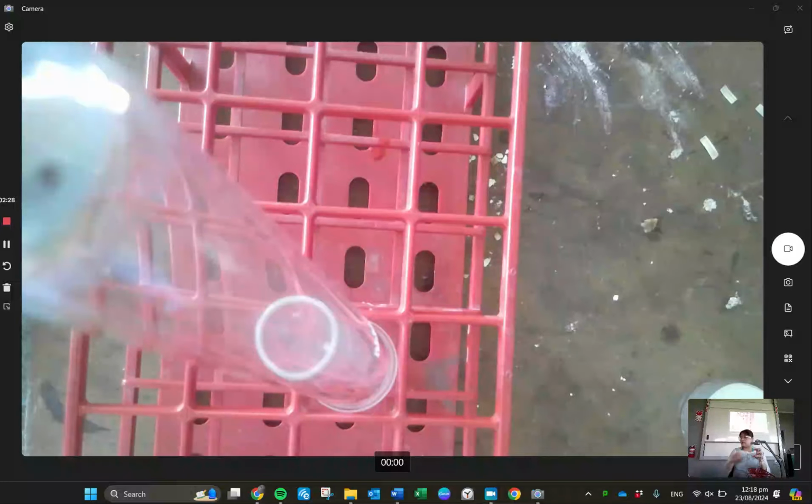All right? So I now need to figure out, is it the hydrogen ions or the sulfate that is forming the bubbles? So if we look through our little list, we know first off when we're watching it that all the options with the sulfate ion that are aqueous, we know that's not an option because there's bubbles forming. So one of the products must be a bubble forming item. The sulfate ion can form sulfur dioxide, which is a gas. The hydrogen ion can react to form hydrogen, which is a gas. And I'm trying to see if I can see anything else with the hydrogen, and I don't think so. So that's all we have.